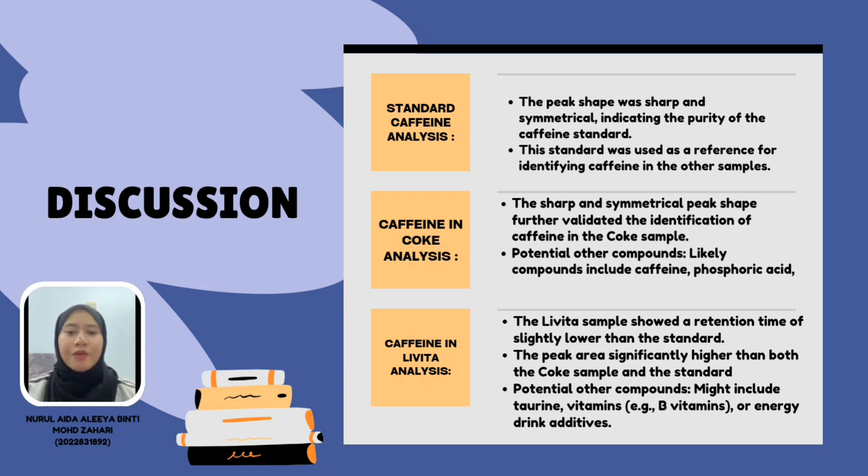The Coke sample had a retention time nearly identical to the standard caffeine retention time, confirming the presence of caffeine in the Coke sample. The peak area was slightly higher than the standard caffeine, indicating a higher caffeine content. The sharp and symmetrical peak shape further validates the purity and presence of caffeine in the Coke sample. This indicates that the caffeine concentration in Coke is slightly elevated compared to the standard solution.